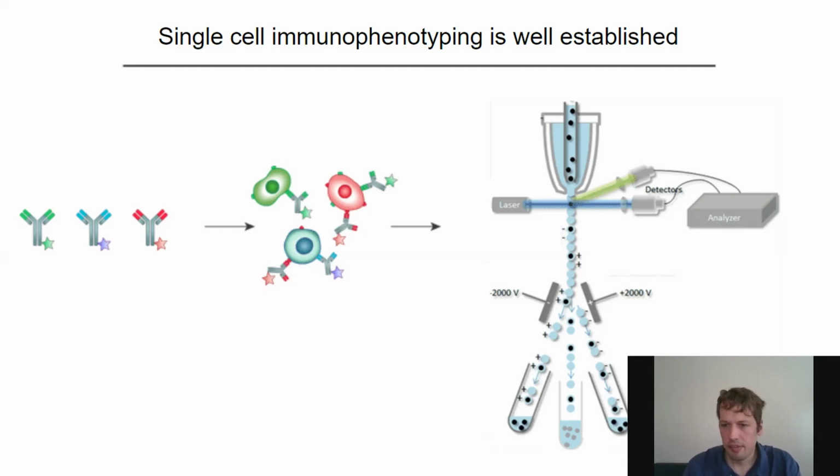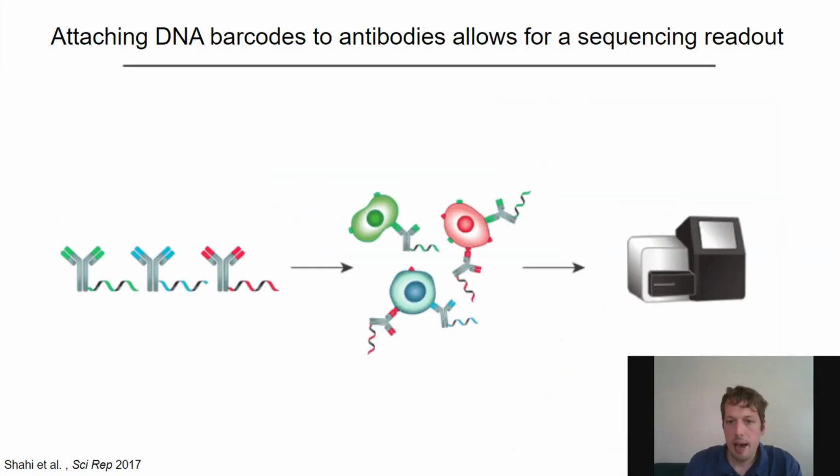However, this seems very cumbersome, and it can only really work if there is a tight connection between the immunophenotype and the genotype. That's basically the only way such an approach could resolve the connection of phenotype to genotype. So we thought, Adam and I, how can we make that better? How can we have a more general solution? And so what we thought of was DAb-seq, a method that the Abate lab has previously developed.